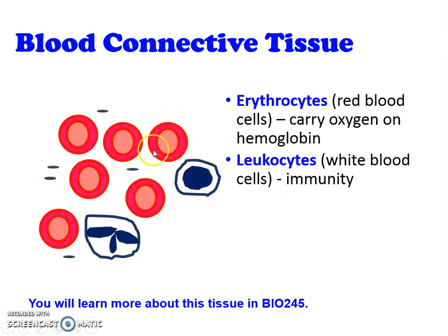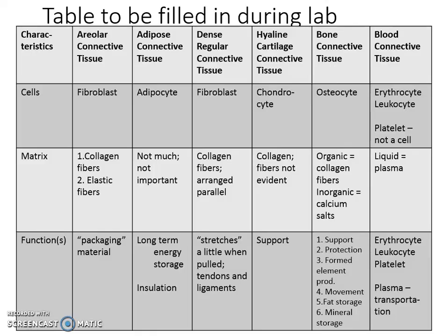97-98% of all the cells that you find are going to be erythrocytes. 2 to 3% of the cells that you see are going to be leukocytes, and these cells are responsible for helping us to fight off pathogens. We're also going to see these little cell fragments in between all the other cells. These are platelets, and platelets are going to be used to help blood to clot if there's damage to a blood vessel.